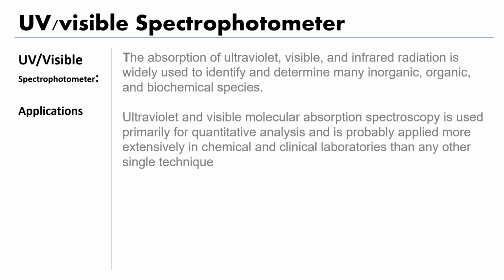So these are the different uses of the UV visible spectrophotometer, and you can check different books and note down the various applications of the spectrophotometer in the fields of biology, chemistry, or plant sciences. This is the most widely used and important technique in analytical biochemistry. Thank you.